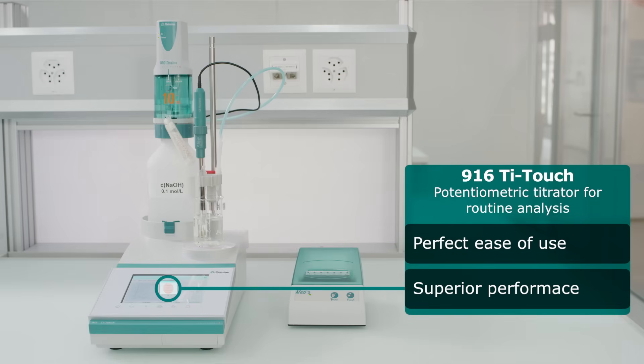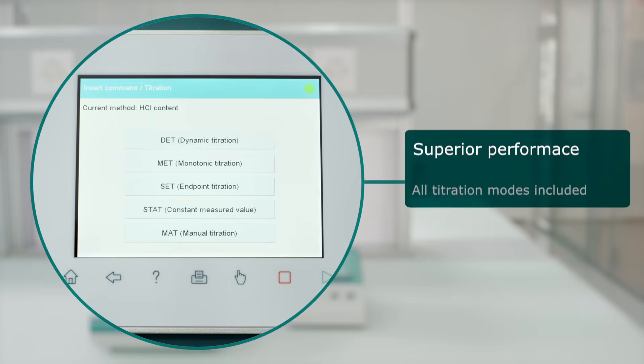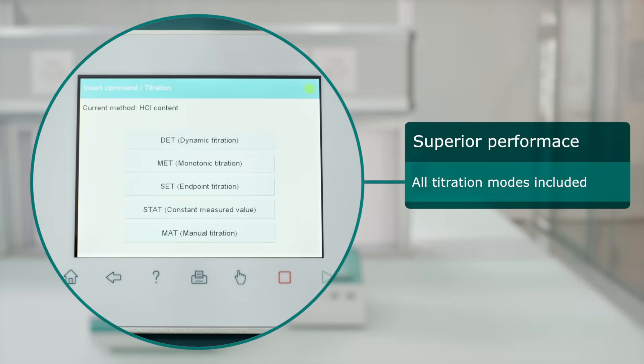The 916 Ti-Touch covers all standard potentiometric titrations: dynamic, monotonic, fixed endpoint, pH stat, and enzymatic titrations.